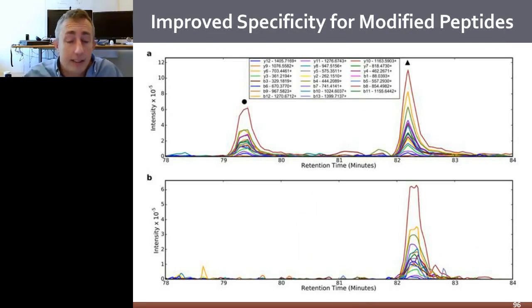One thing that's a little bit striking here is an oxidized form of the same individual peptide. When you have 10 mass charge wide worth of data, that oxidation is a 16 Dalton difference. It's 8 mass charge, so both of them fall within the same isolation window. They have almost the exact same fragments up to the modification, an oxidized methionine. So you can't really distinguish between them until you get down to that 4 mass charge isolation window. So this bottom chromatogram is actually 20 mass charge worth of data that demultiplexes into the individual components.